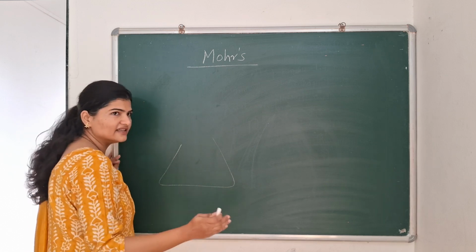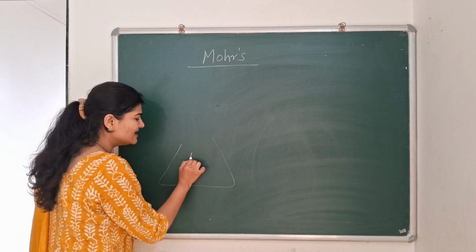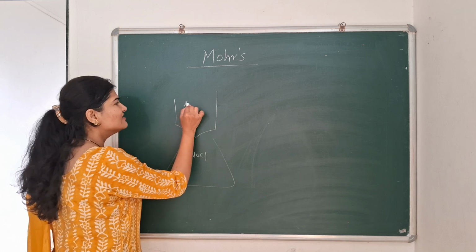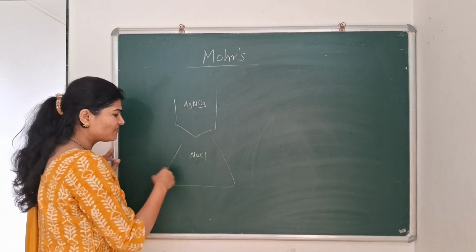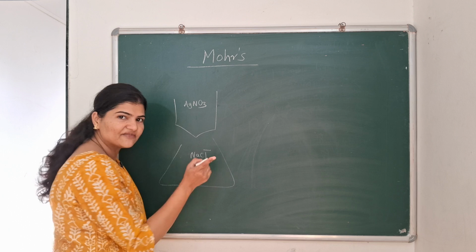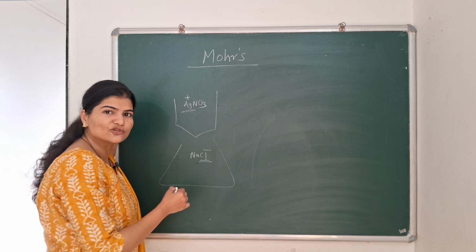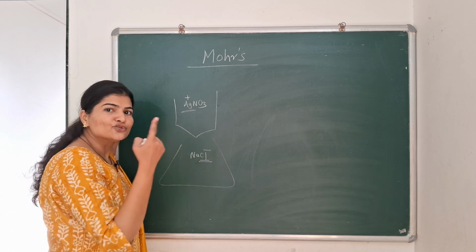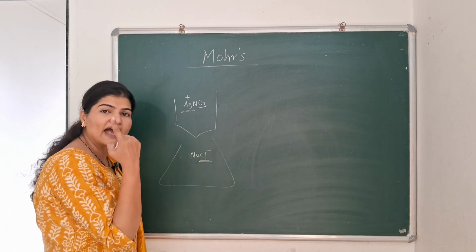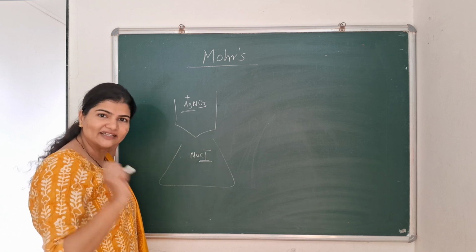be the halide ion. Let's take an example of titration of 0.1 molar NaCl solution with 0.1 molar silver nitrate solution. NaCl is a halide ion solution, which is our analyte, and silver nitrate is a silver ion solution, which is our titrant. As we discussed in the earlier video, when we use silver nitrate as our titrant, the titrations are referred to as argentometric titrations.